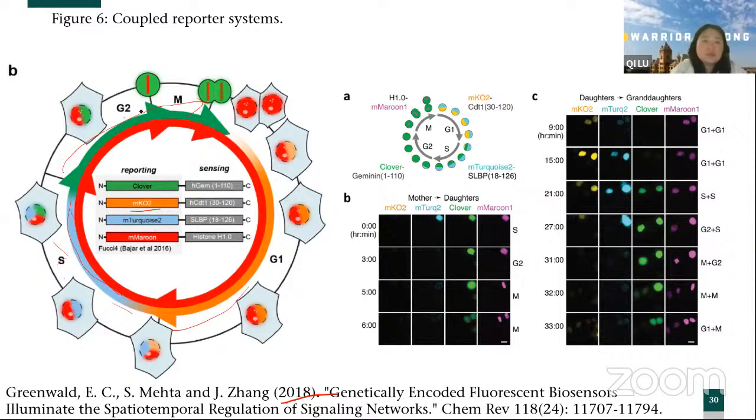There's even more, because we know that for the fluorescent, we can use a different filter to only see a single color. So we can block out other wavelengths and only see the blue one, and then we'll know that, oh, okay, this is in the S stage.